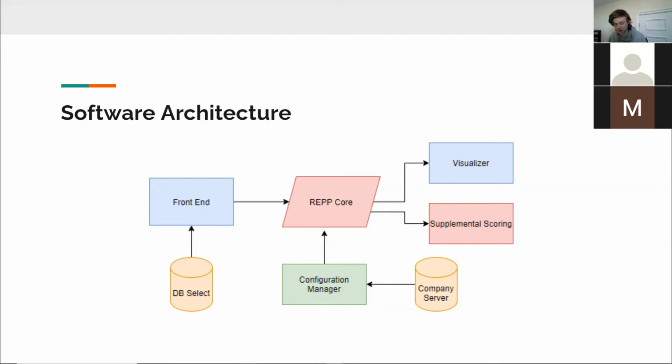PCADA has two major components, the core REPP module, which handles cost evaluation for the design, and our external support infrastructure. On the front end, the user interacts with an SFML-based GUI to select the parts databases where components of the target DNA sequence will be selected. Currently, the tool supports standard REPP databases, including iGEM, AddGene, and DNA-SU. The user will also enter the name of the FASTA file containing the DNA sequence of interest.